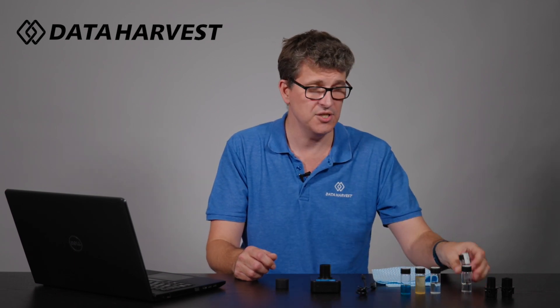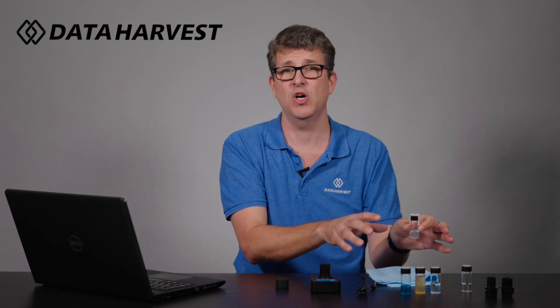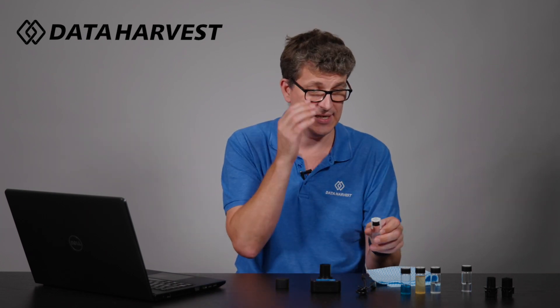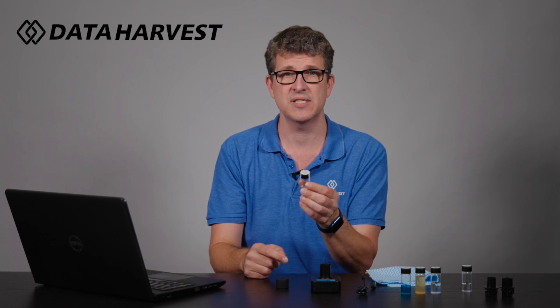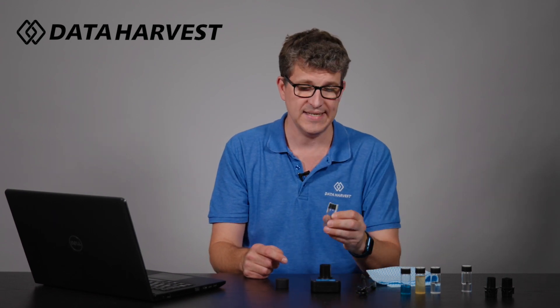So we have the 100 NTU sample. The turbidity pack is an optional extra pack because not everybody who buys the colorimeter wants to do turbidity — hence there is a little extra pack if you want it. The 100 NTU sample here: please never take the lid off. It's sealed with strong tape on purpose and should never be opened. We also need to calibrate the sensor.